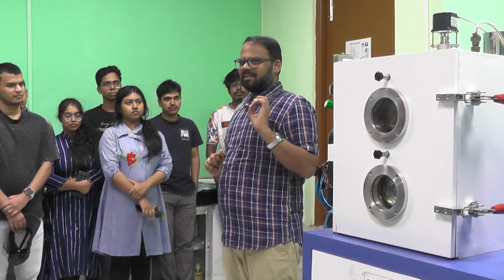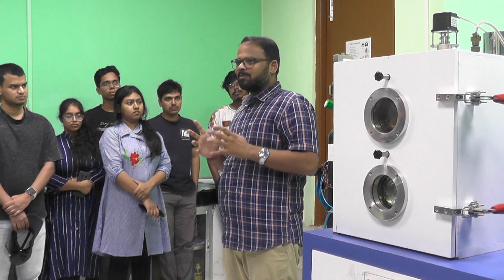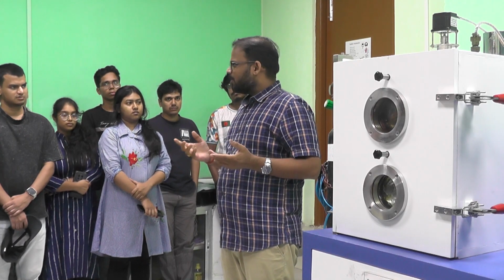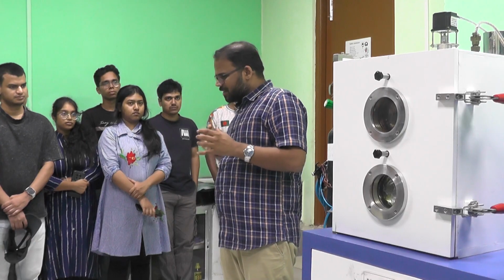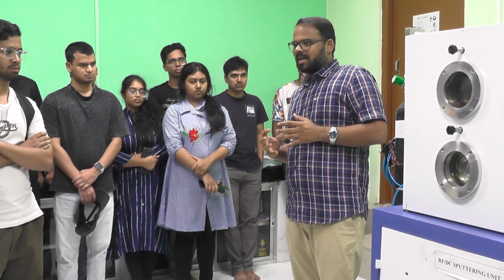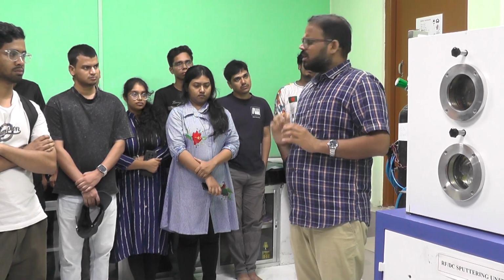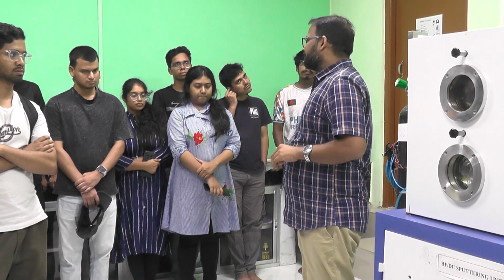So GST, germanium antimony telluride. What is rich? What is more? Tellurium. So it means tellurium you need to provide more. In which way? You can either provide more power to them, or less. Okay, so that tellurium content will be more. So it's a part of co-sputtering.